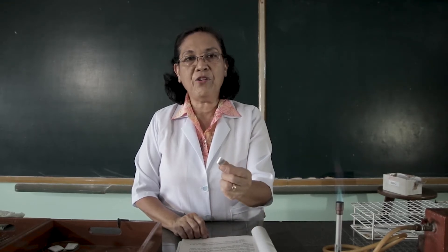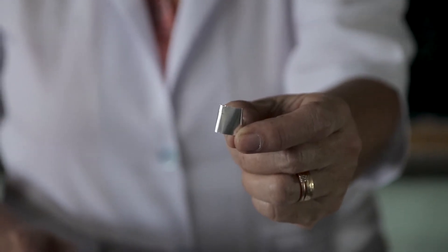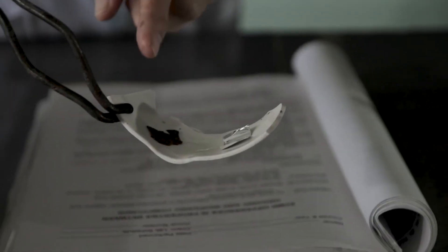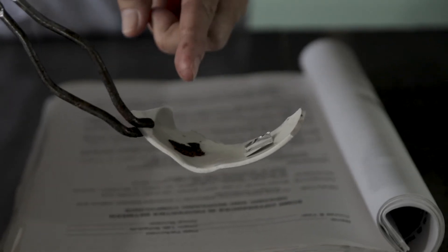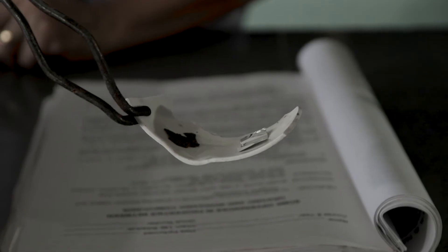Then, we are going to heat this piece of aluminum foil. Take note of its color and appearance. Observe what happens. Remember that this black one was the product after heating the plastic, and this other one is the aluminum foil. Observe, especially the color.